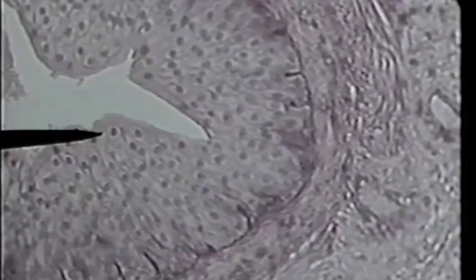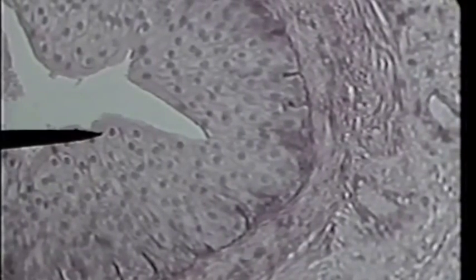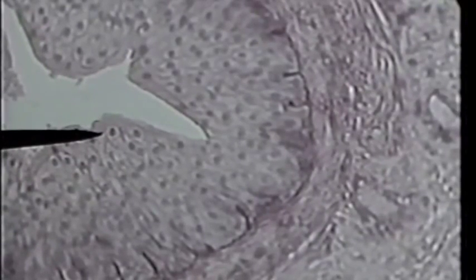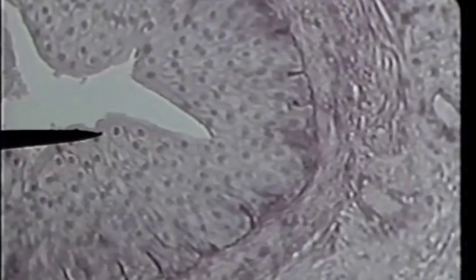The most superficial cells are the ones that tip us off that it is transitional. The cells actually have a domed apical surface. That's how you can tell it's transitional.